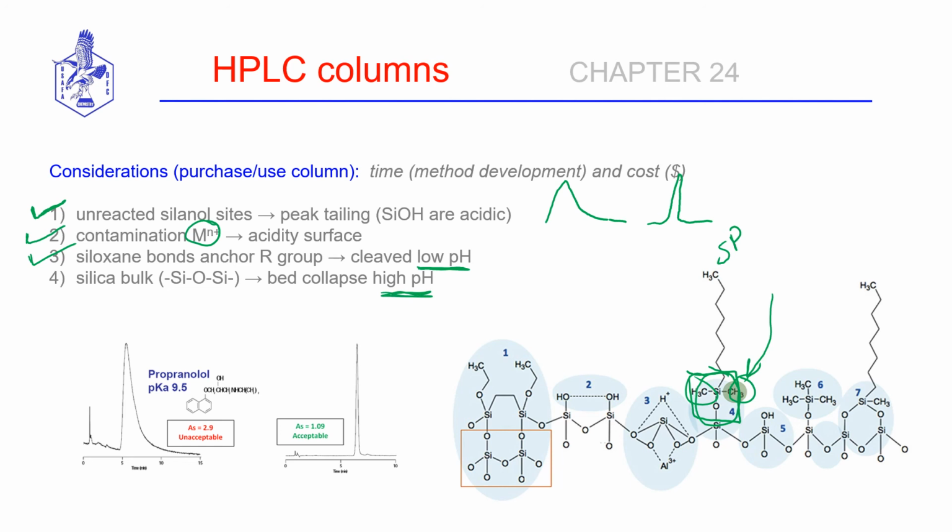Historically, what happens at high pH is we are going to potentially break the siloxane bonds exposed on the surface, and under the high pressures coming through from the mobile phase, okay, we can actually cause our silica support to collapse. And once the particles within the bed collapse, the performance of the column is going to change drastically, and so we're back to square one, needing a new column and developing a new method. So we want to avoid all of those things.